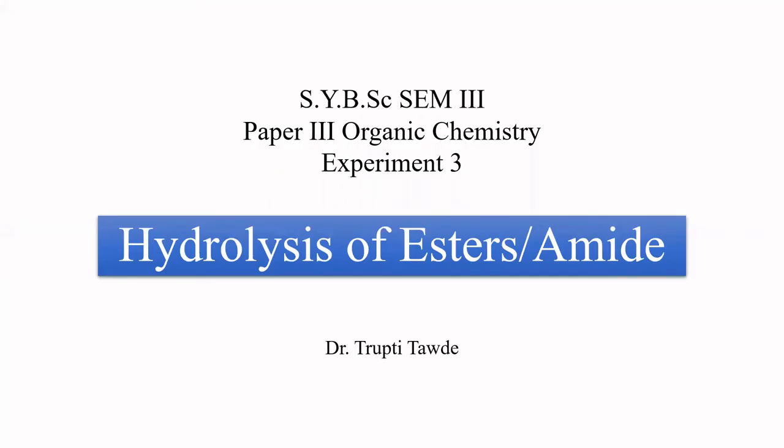Hello everyone. In this video, we are going to discuss experiment number 3 for your organic chemistry. We're going to talk about hydrolysis of esters or amides that we can perform. Let us first understand why this hydrolysis is so important to study.